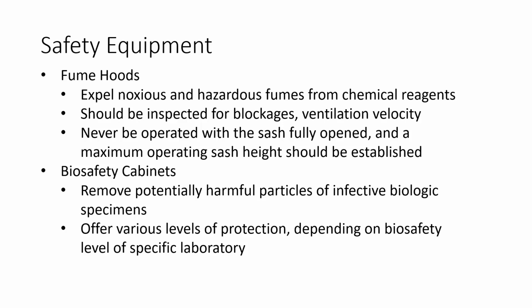Biosafety cabinets can typically be freestanding units that just require an outlet to plug into the wall because they are recirculating the air into the room after passing it through a HEPA filter. HEPA filters, if you have heard of from microbiology, do not capture viral particles or anything smaller, any smaller type of bacteria. So although they are able to capture most mold spores and that type of stuff, there are things that can go through those HEPA filters. So that's just something to keep in mind.